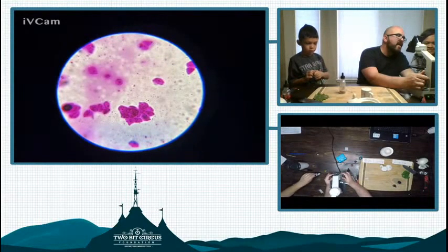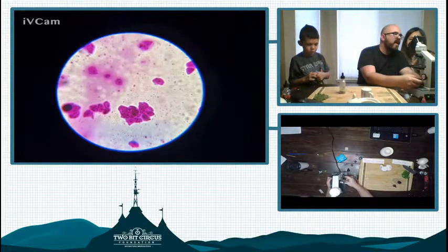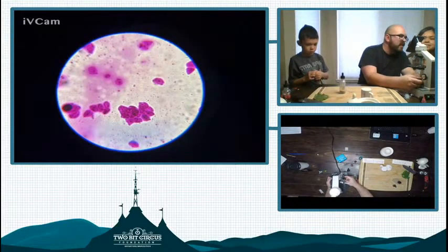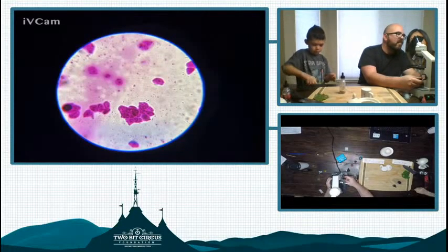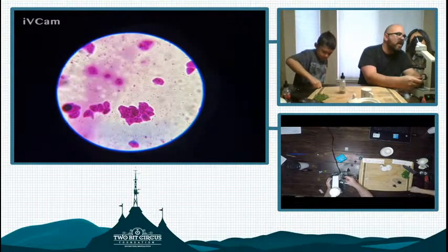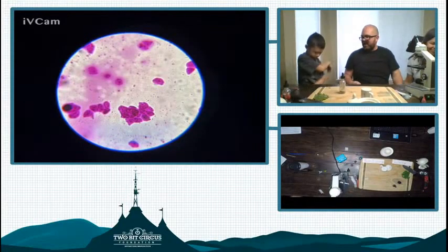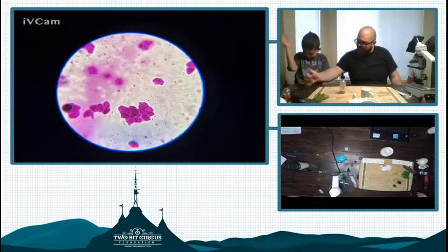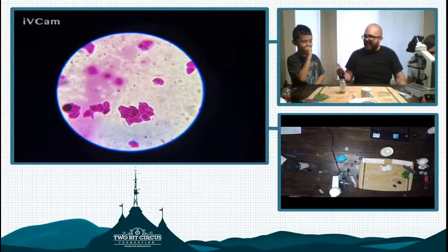Now, maybe the way it dyes the cell might be different because methyl blue is supposed to dye the nucleus, right? Methylene, yes. Methylene blue. But I'm pretty sure that we could say that Robert is officially alive. Robert, look at you. You're gonna do your dance. You were right. You're alive. That's it. That was a very exciting dance.